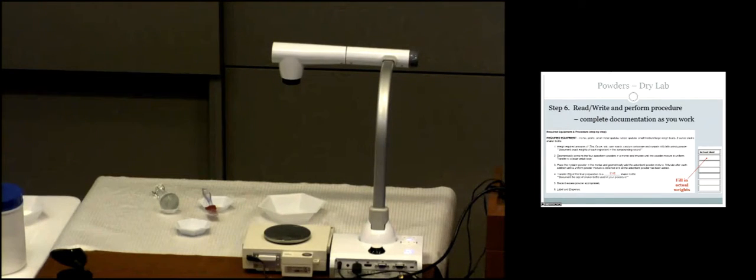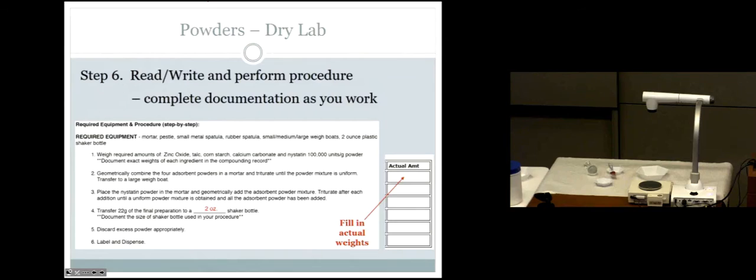Does anyone know what methyl salicylate is? The same as oil of wintergreen. That's the oil of wintergreen. So knowing that, you can call it a wintergreen scent. Or you can call it minty. Or what I'd like for you to do is, when you're all done, try to describe it. You see what I'm saying? So use terms that best describe that scent. That's the best you could call it. Anyways, we'll try it with that. So you do need to try to come up with some sort of scent. Yep.